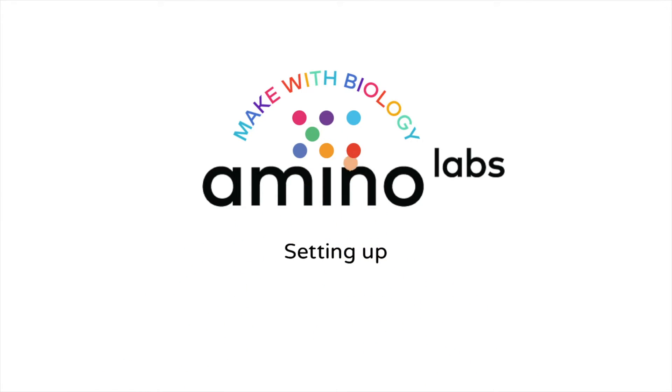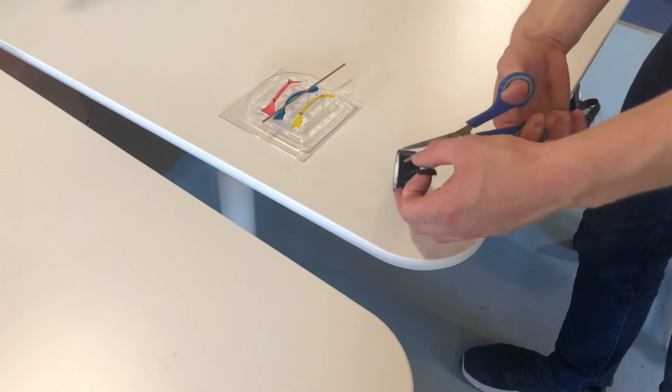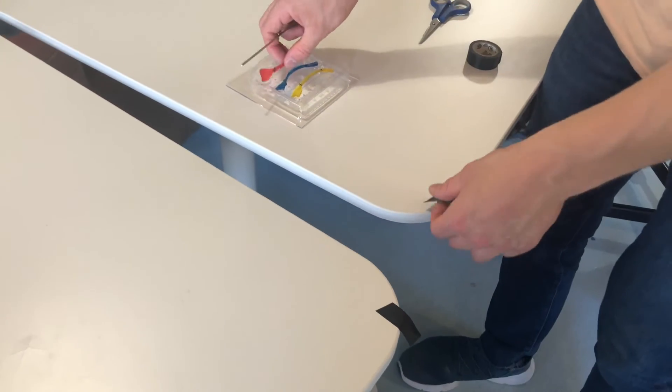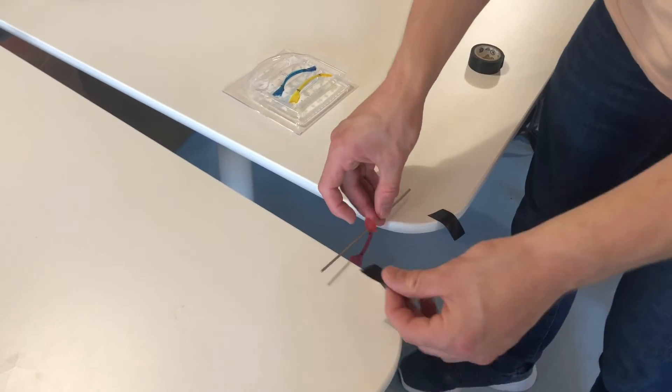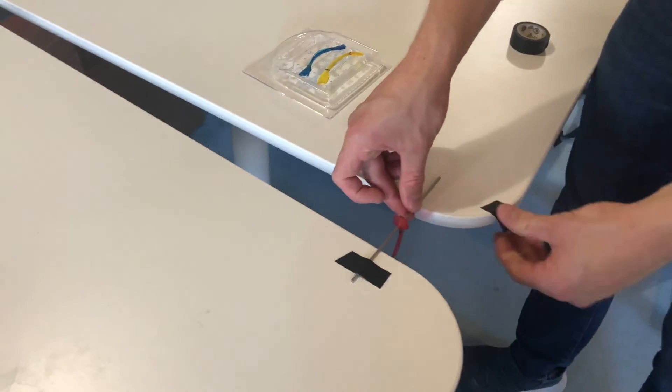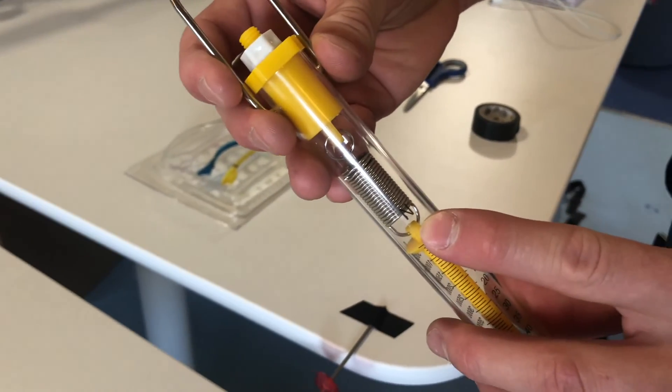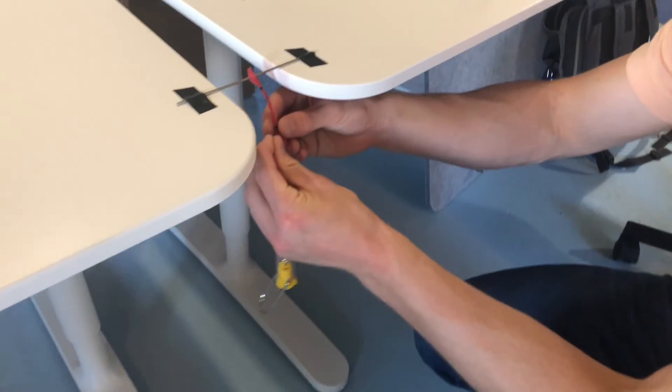First, take two tables and move them so that they are 4 to 5 inches apart from one another. Cut two pieces of tape and then take your metal rod or wooden dowel, poke it through one of the previously made holes in your dumbbell, then tape the rod to the tables so that it spans the gap. Take your force meter and attach it to the second lower hole in the dumbbell so that it hangs.